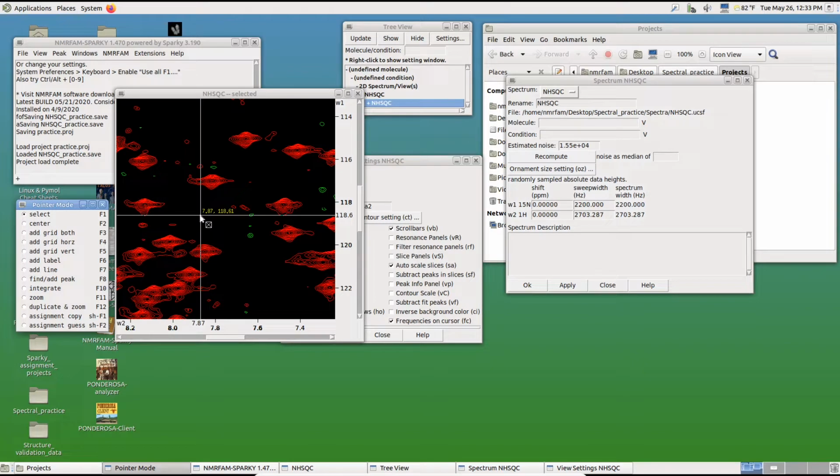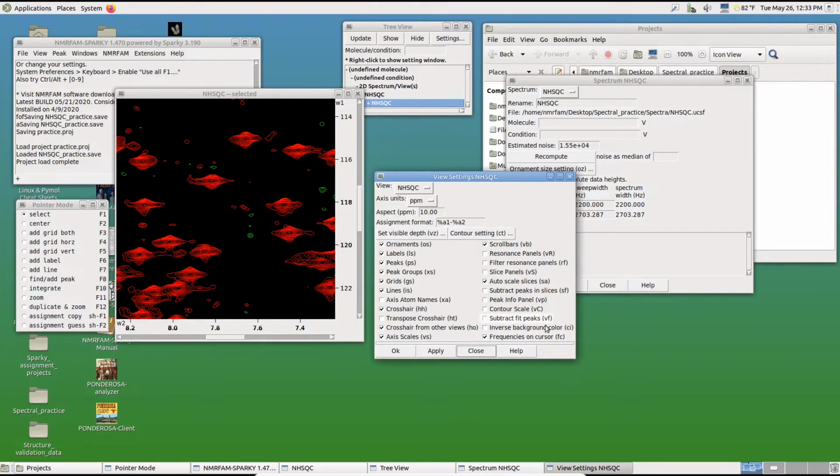And you also see the chemical shift value in yellow text. In case you want to hide it, you can change here from the view settings or the two-letter code FC. You can just turn that off. It's no longer there. If you want to use it, you can just re-enable it and you see that too. So view settings are all kind of these settings.